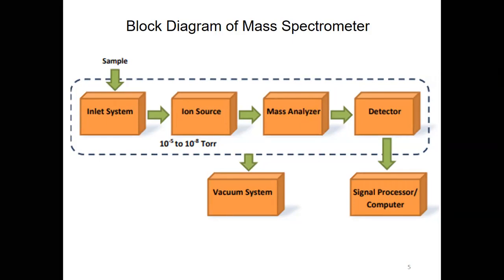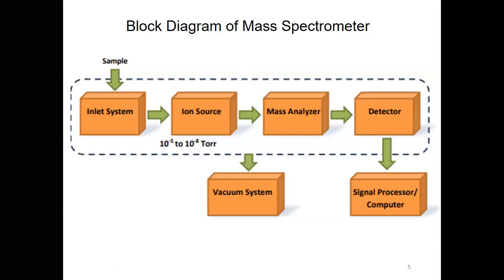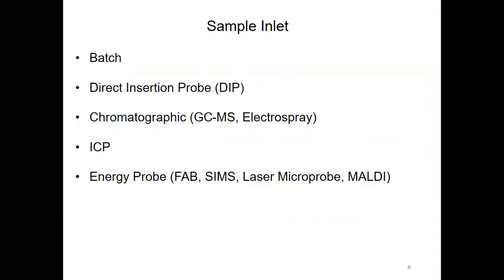We will study each and every component of this instrument: the inlet, ion sources, mass analyzers and detectors. That will be the basic thing that I will teach you.